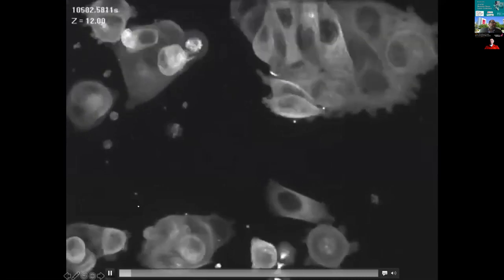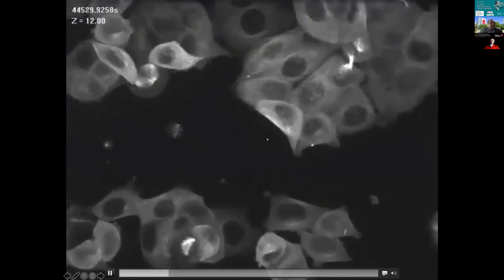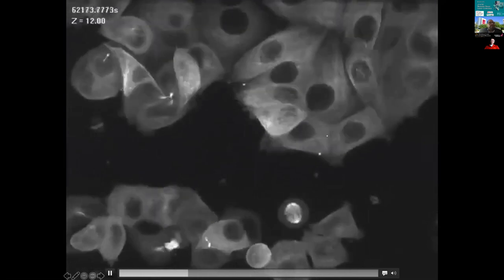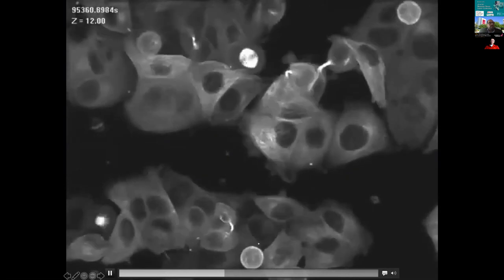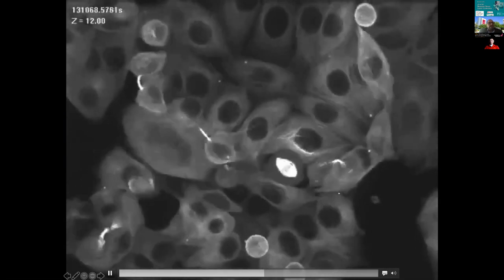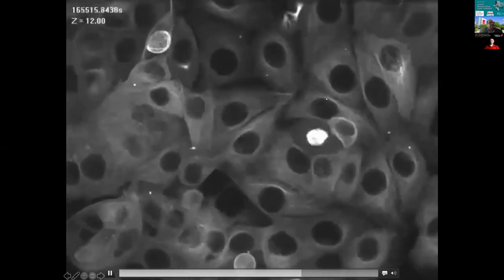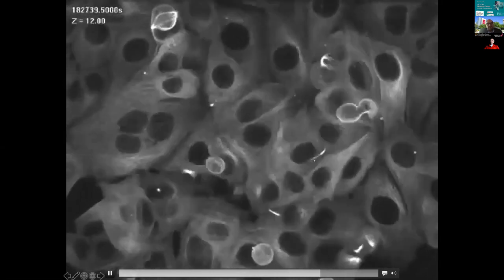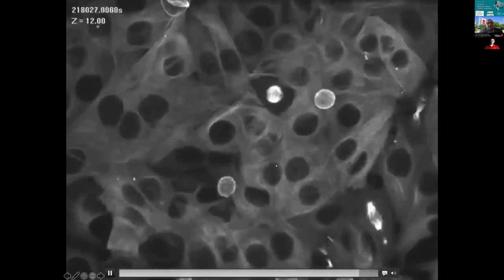So how do cancer cells look? This is called a time-lapse video. These are cancer cells moving over about 2 days' worth. We've increased its speed. What you end up seeing is that these tumor cells start to proliferate, or divide. And you see these little tumor cells here that are floating around. Well, this is sort of them picking up from the dish and just floating away. And this sort of is what happens with metastasis.